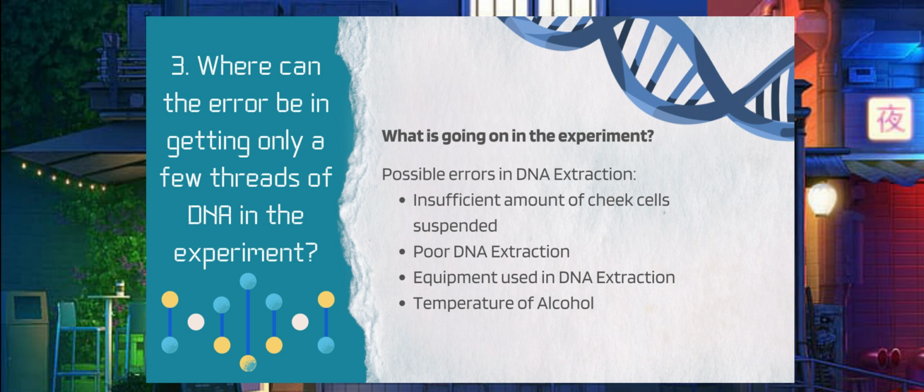Okay, third potential error, or third factor, is the equipment used during DNA extraction. Pipettes are the most common tool in DNA extraction. However, in this experiment, the experimenter just utilized a plastic spoon to extract, transport, or dispense liquid samples.